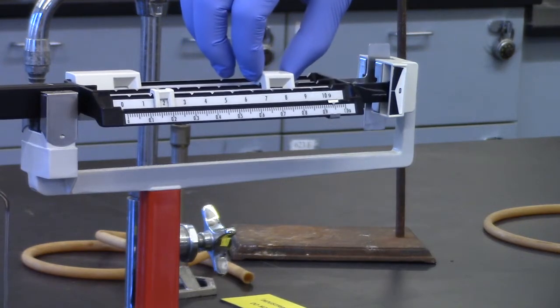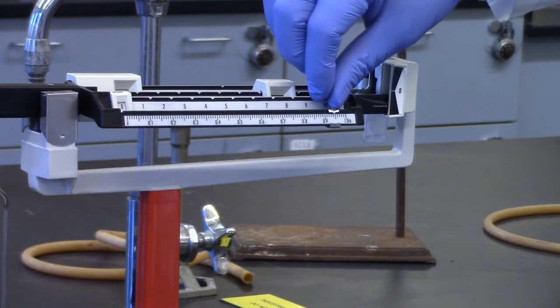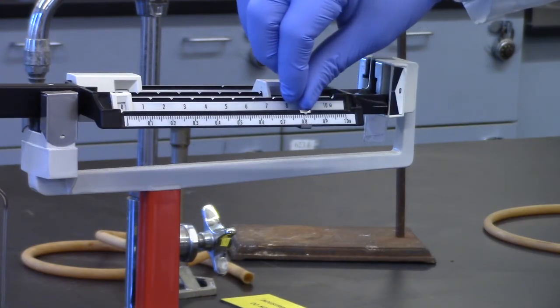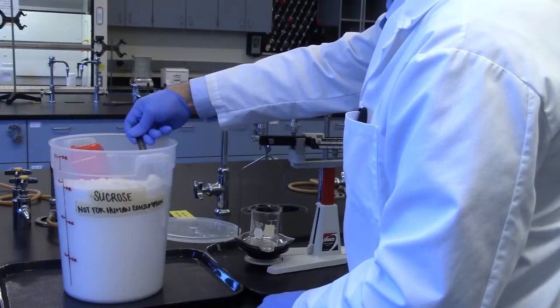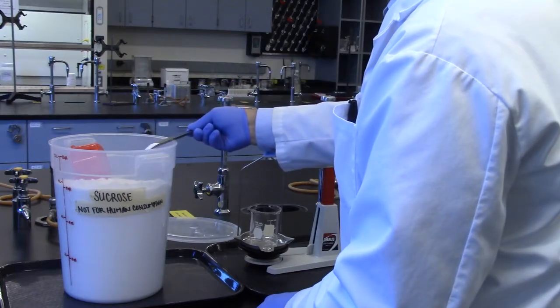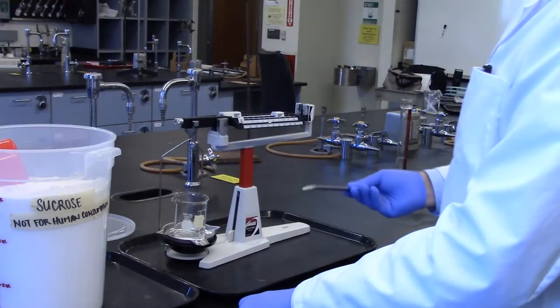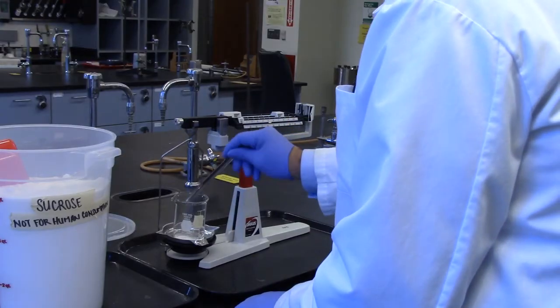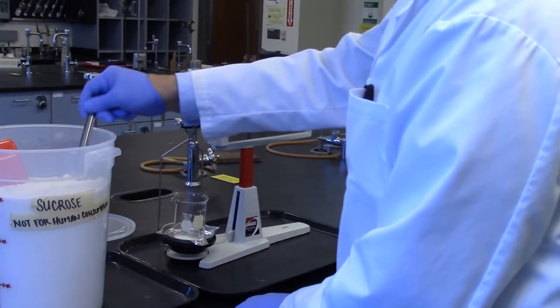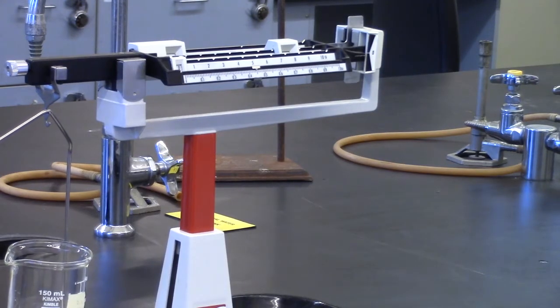Add an additional 7.5 grams to the slider, then add sucrose to the beaker. Slow down as you approach 7.5 grams. Record the mass of the beaker plus sucrose when the balance point is reached.